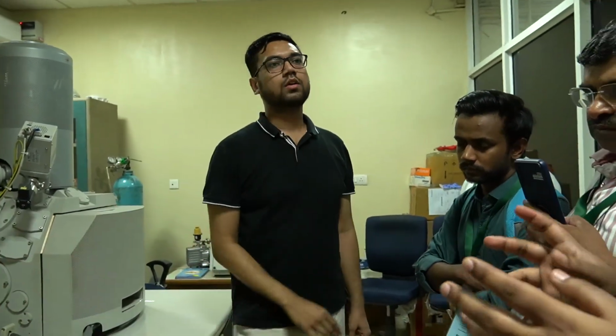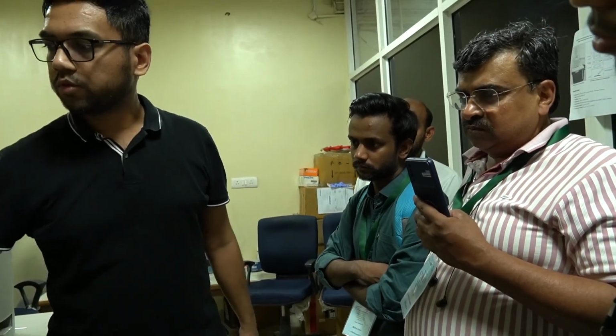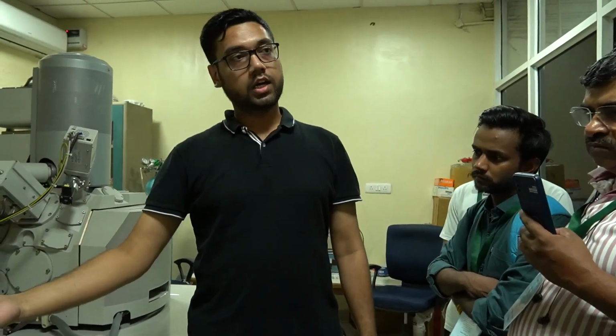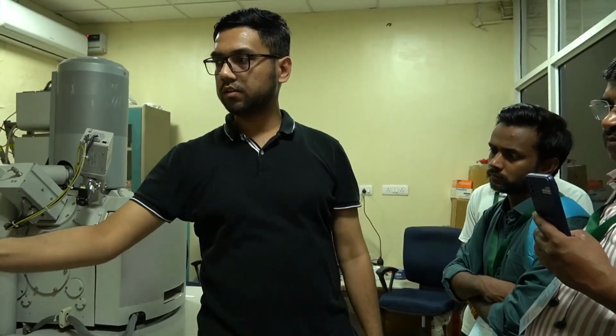So in between the process you do that? No, not during the process. First of all, we have to confirm the nature of our sample. If it is conducting, then we are okay. We just deposit it on the stub and we are good to analyze it. If it is not conducting, then we have to coat it first. Yes. Then place it, and otherwise, you can start with the scan.